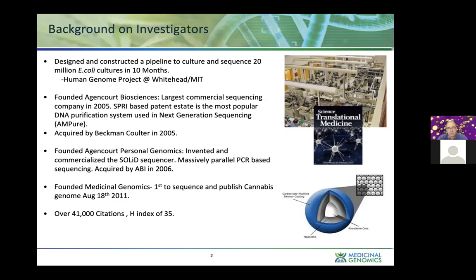We had another $6 million from NHGRI, and we built a DNA sequencer that is showcased here on the cover of Science Translational Medicine. This is a SOLiD sequencer. ABI came to acquire that technology. They ended up commercializing it and capturing 35% of the market share by 2008 next to Illumina. The company was eventually acquired by Life Technologies, largely justified on incorporating the SOLiD sequencer into Life Tech's portfolio. This system utilized massively parallel PCR of single molecules.